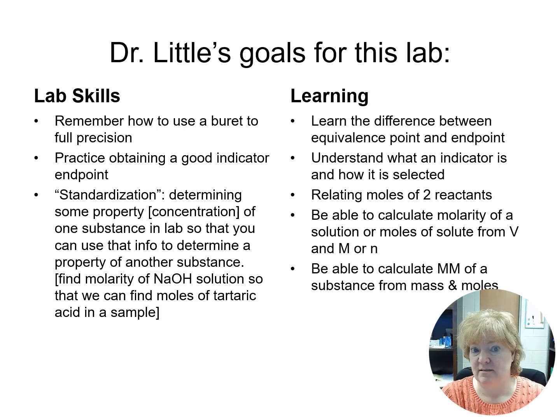On the lab skills side, you have learned how to use a burette, but we're going to get really good at using it to its full precision and getting a good indicator endpoint, that one drop light pink endpoint.